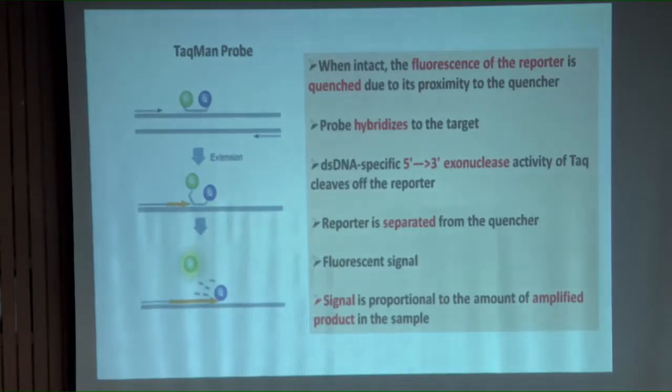The probe hybridizes to the target because the target is made single-stranded, since you subjected the DNA to high temperature, that is 94 to 96 degrees Celsius, what is called the denaturation temperature. Is it clear? Now the double-stranded DNA is specific. Here comes the twist. You also use an enzyme for mediating the polymerization. What is that enzyme? Taq polymerase enzyme.